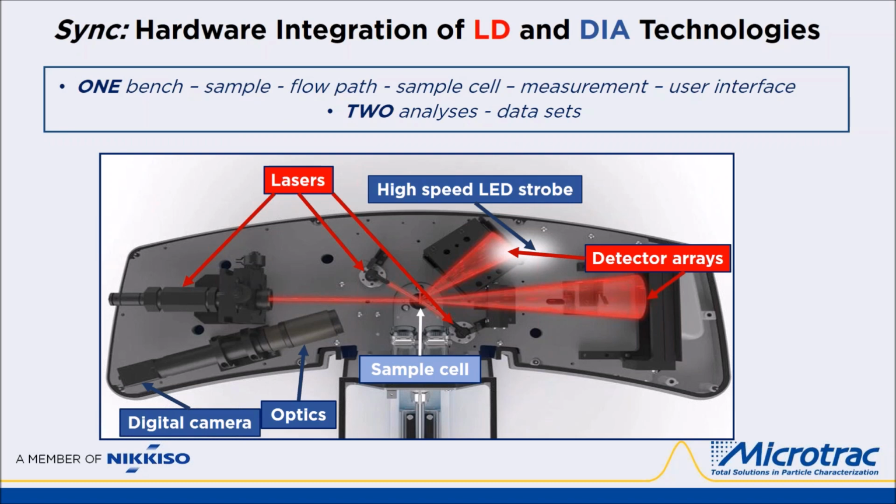And the dynamic image analysis hardware includes the high-speed LED strobe at top and the optics and digital camera assembly in the lower left.